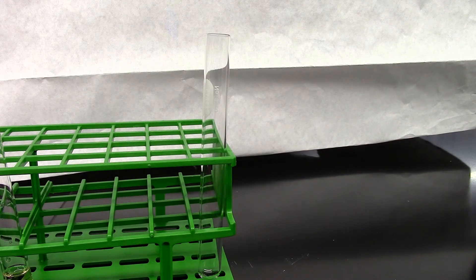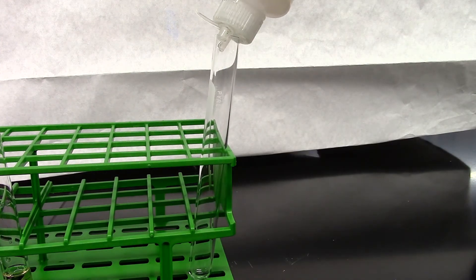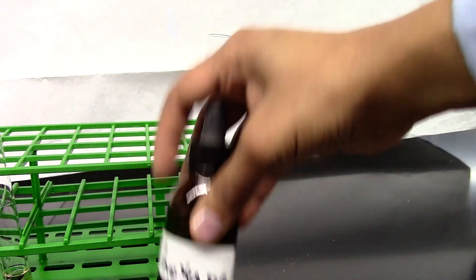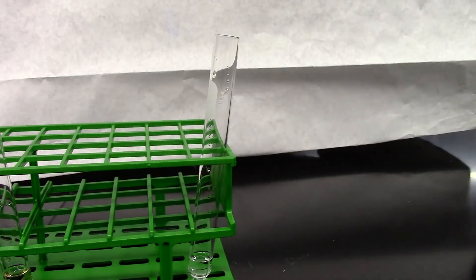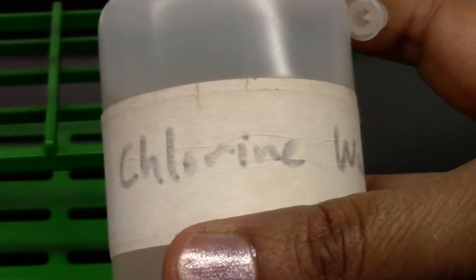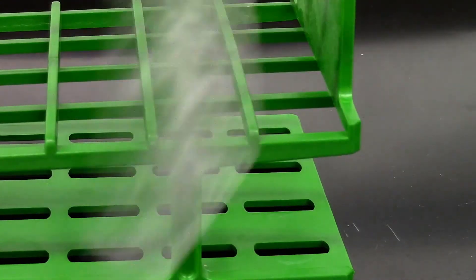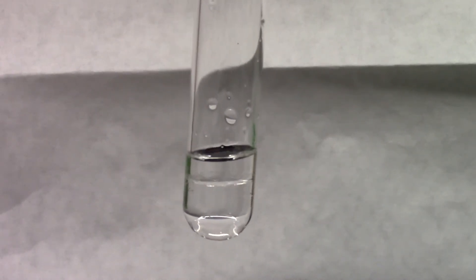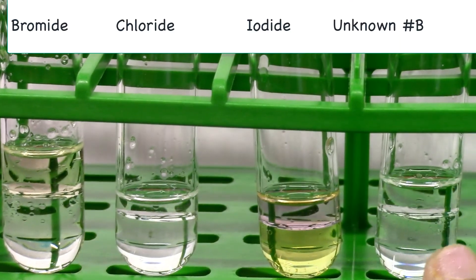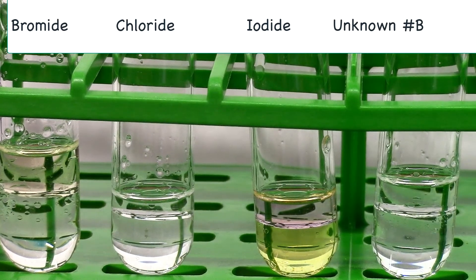We are going to do the halide test for unknown B. I'll add 10 drops of unknown B, 10 drops of hexane, 1 drop of nitric acid, and 5 drops of chlorine water. I'll give it a mix and let it stand. If we place it against a white background, we see the top layer is clear. In comparison to the known solutions, you can come to a conclusion about what the halide ion would be.